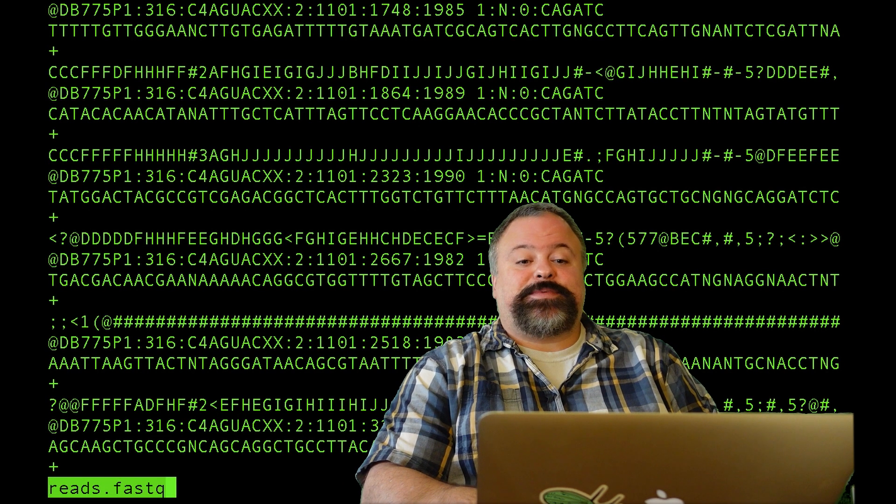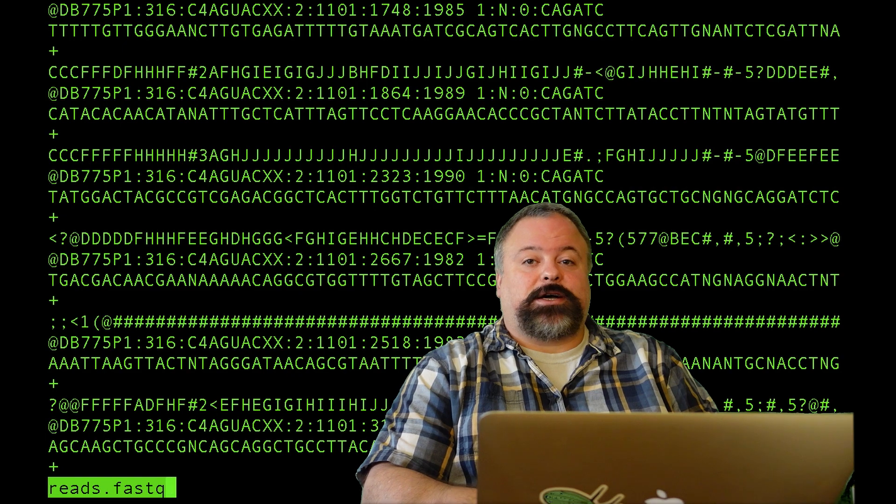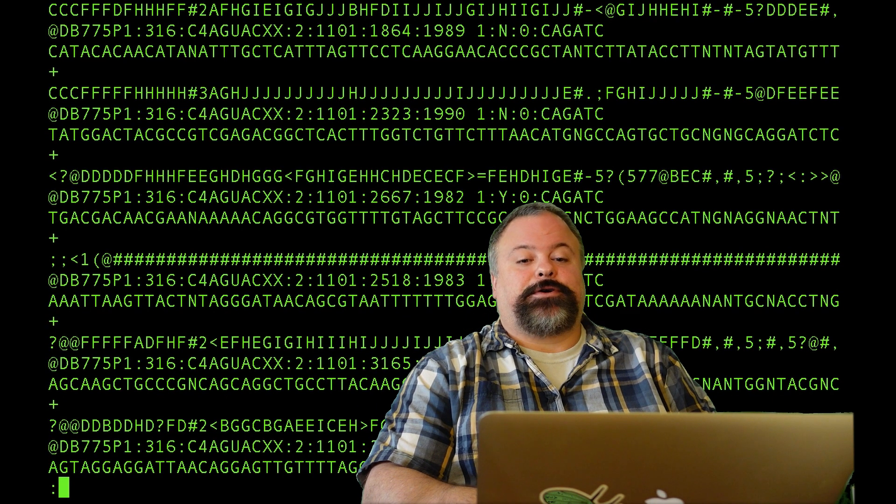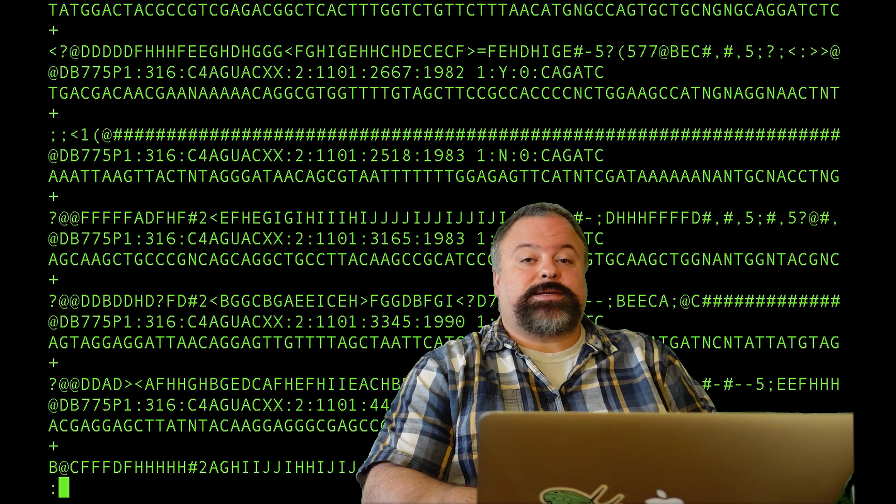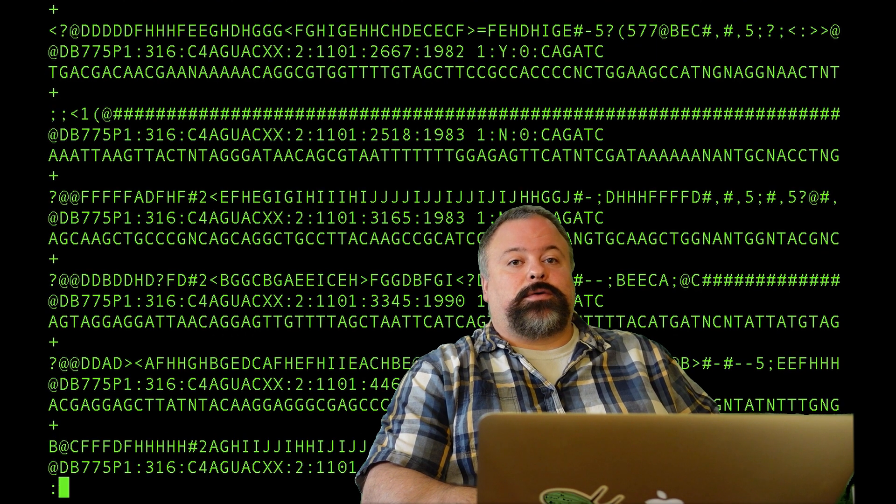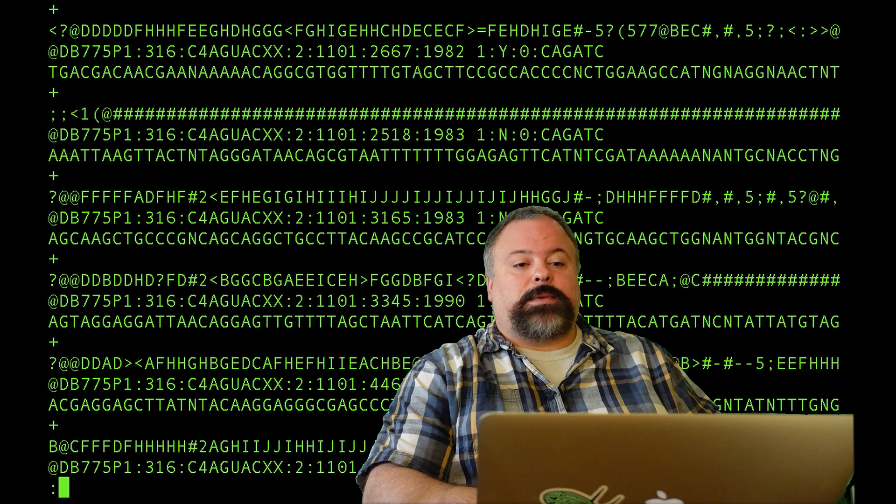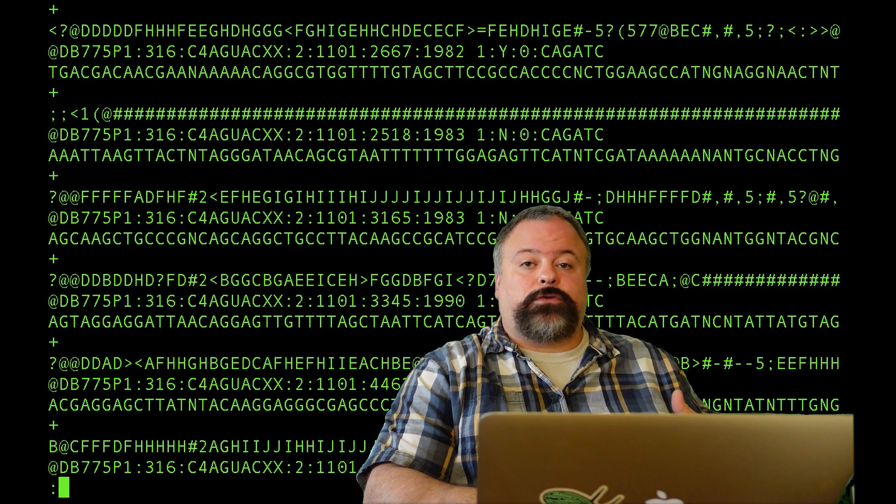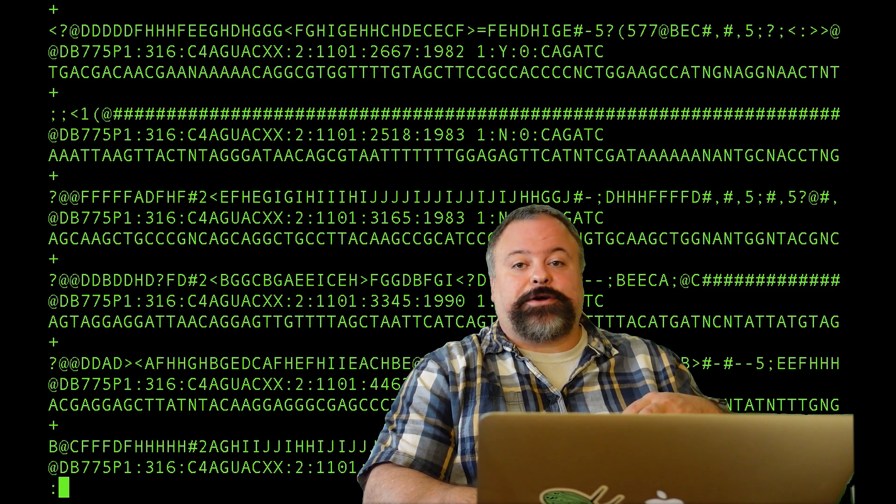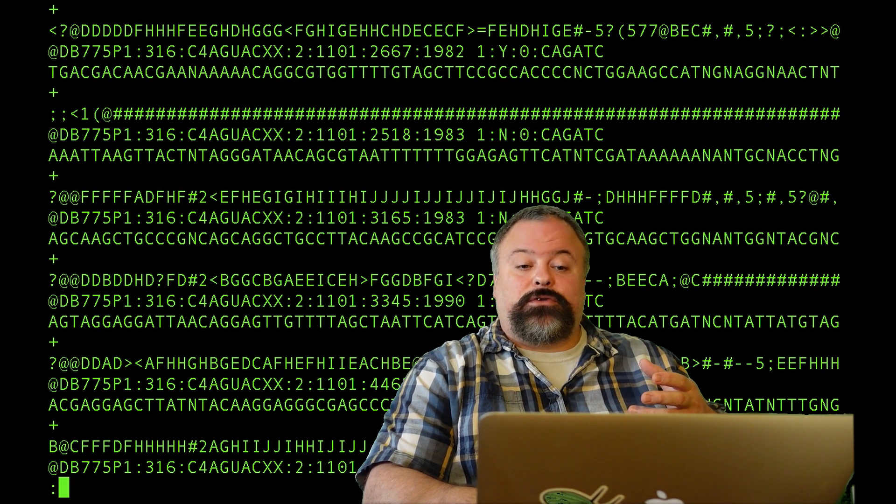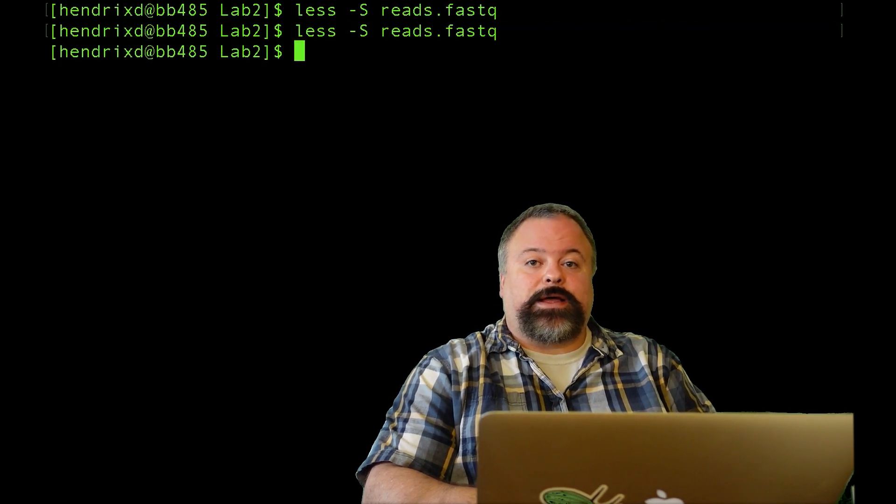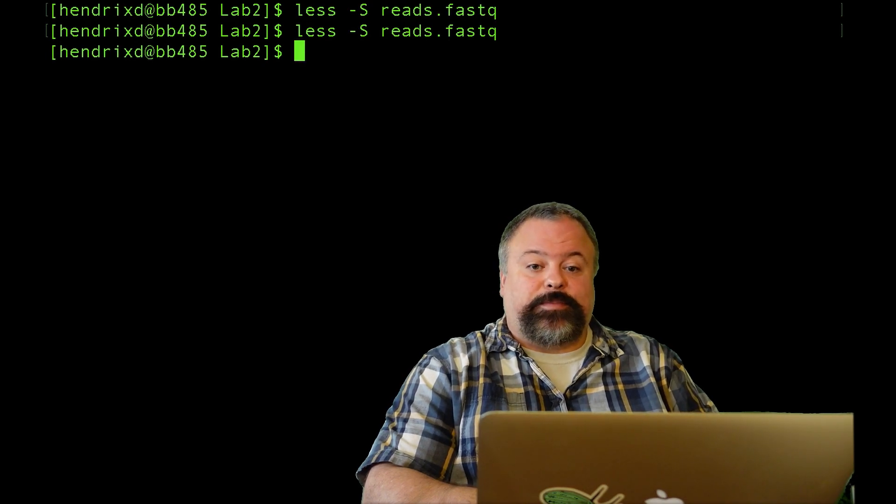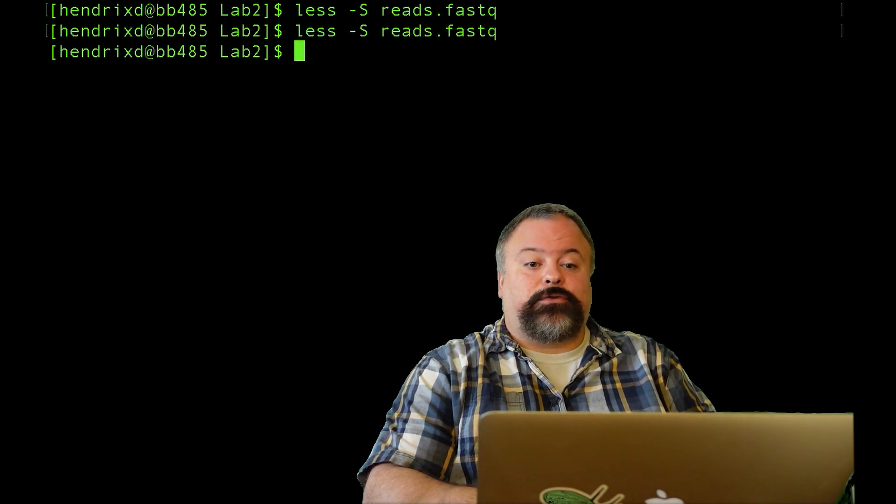It happens to be ChIP-seq data for a Drosophila heat shock factor. So encoded in this information are essentially sequences that could be processed along with a control file of just regular DNA or mock IP or something. You could use this to identify peaks in the genome where the heat shock factor binds, and then ultimately you could do motif finding to figure out what that binding site, that transcription factor binding site looks like under those peaks.